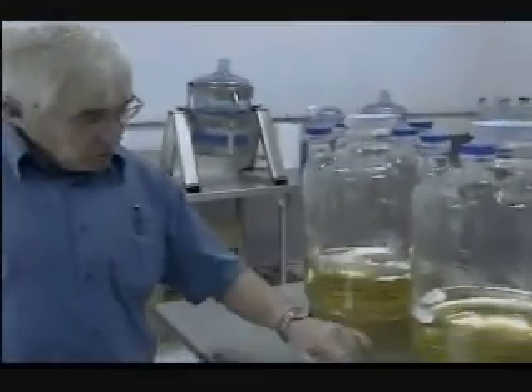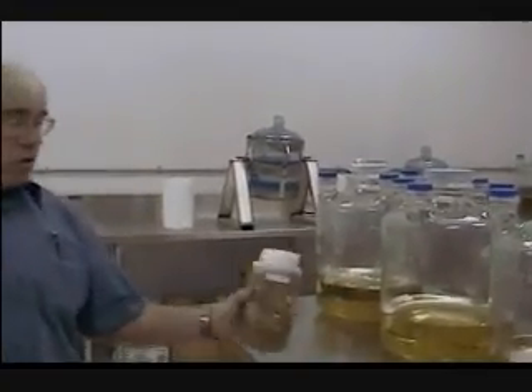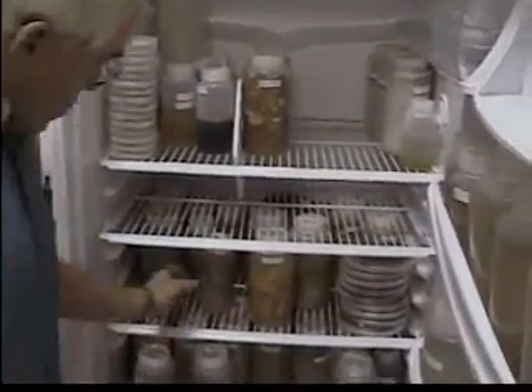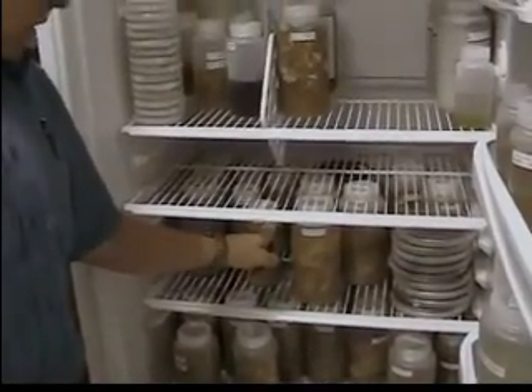These larger bottles are similar to the smaller ones, just larger vessels, and this is the mycelium growing out. These lighter-colored ones are boreal species for boreal seedlings. We're just getting ready to run the special filtering process where we take off the nutrient mixes, harvest the hyphae, and then package them into these containers. That's what we ship — it goes into a cooler, four or five bottles, and that would do a million seedlings. We package it depending on the order size, but normally we get roughly 250,000, a quarter million, per two-liter bottle.